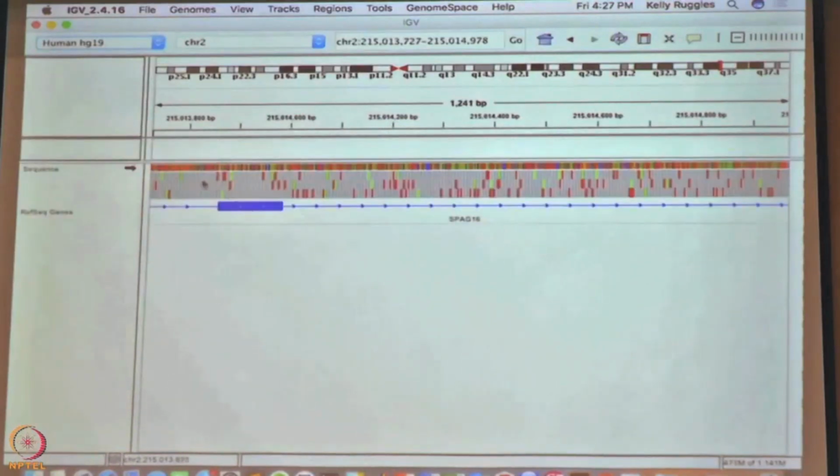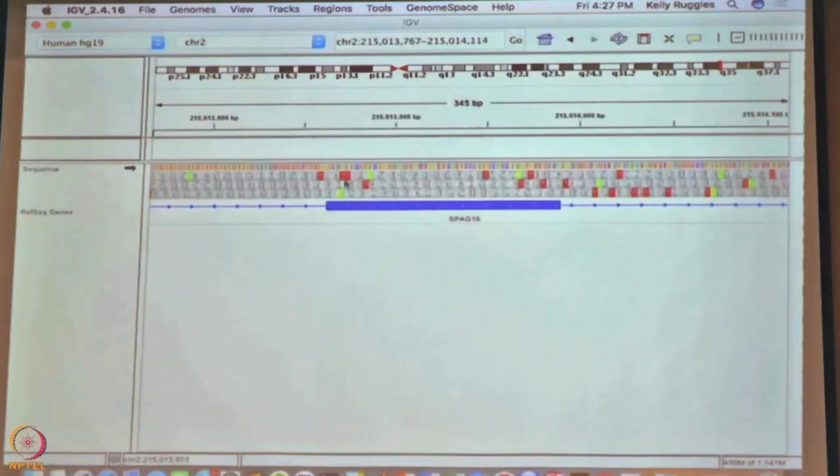There we go. So you should be able to zoom in enough that you're able to then drag it down and you'll get the sequence information. If you zoom in further, it is the nucleotide sequence and then the actual amino acid 3-frame translation. So everybody at least try and get to the point where you can see the sequence.